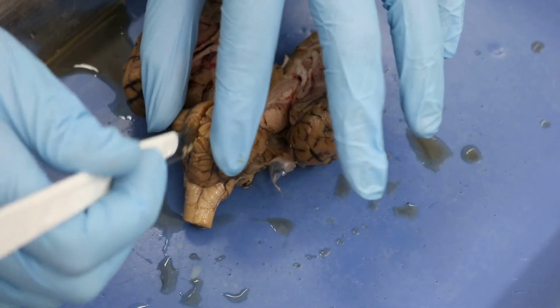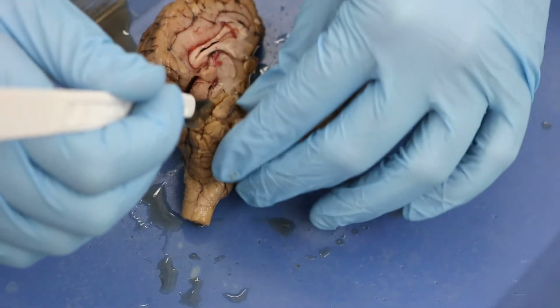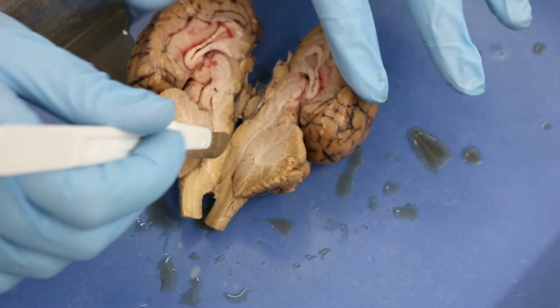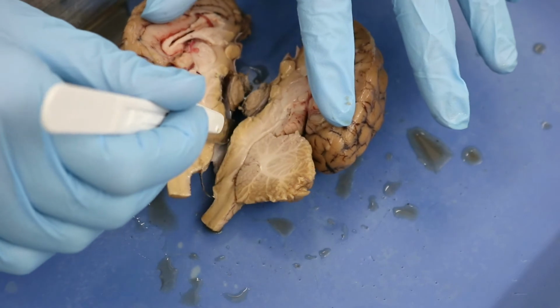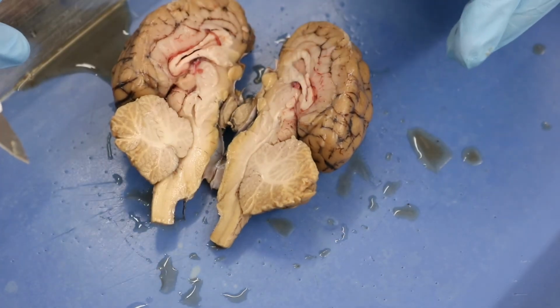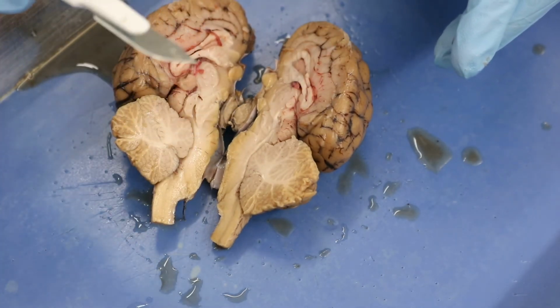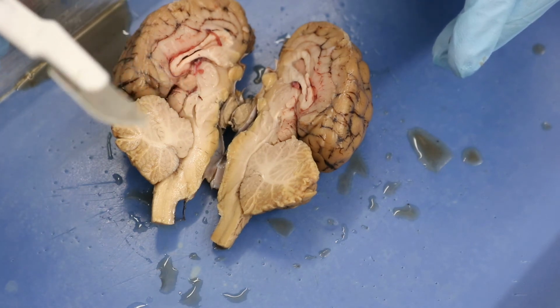And we're still cutting away, all right? Cutting away in our smooth, short cuts, and we now have 2 complete halves. So the important thing is you are now completely done. No more cuts will be happening. So put your scalpel away.